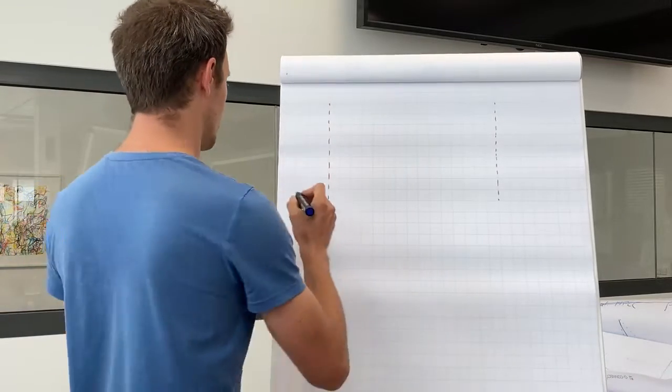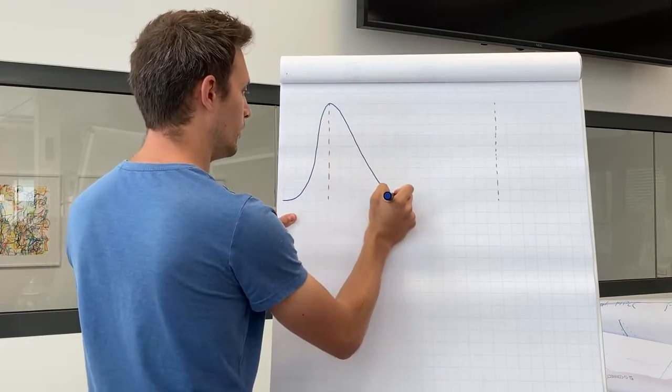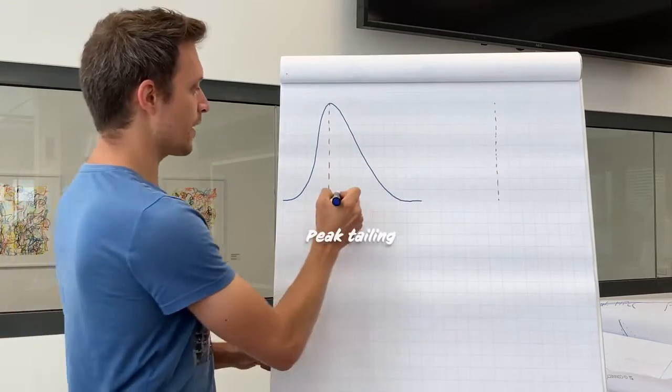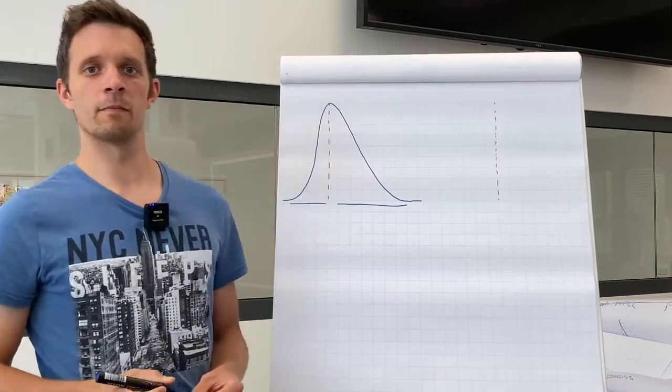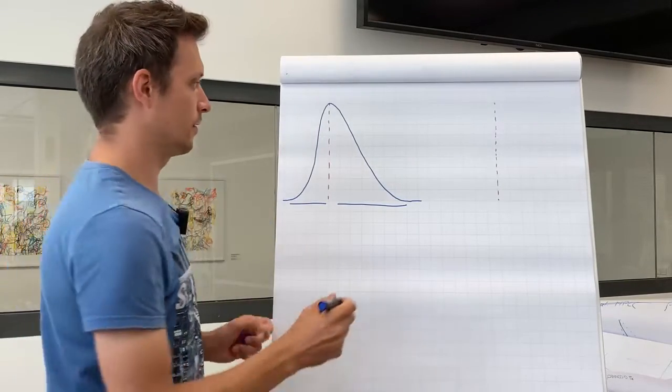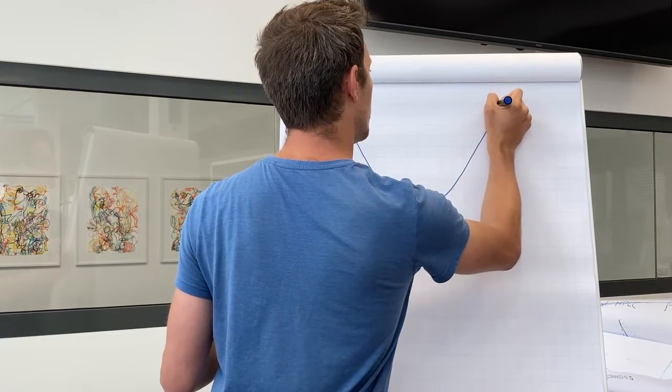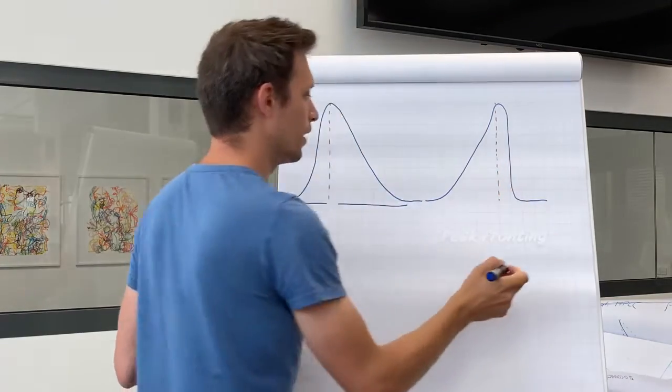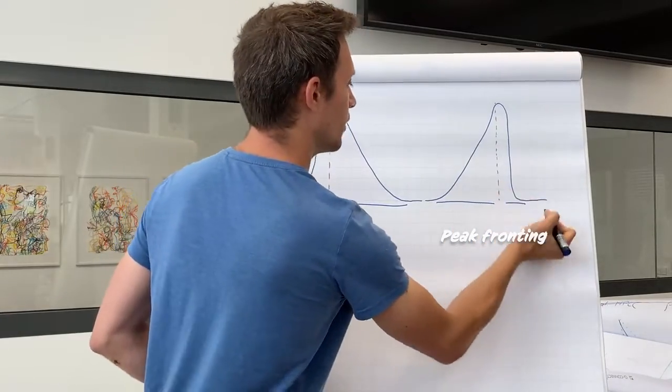First, let's define how these peak types look like. We'll start with peak tailing. Peak tailing occurs when the second half of your peak is much wider than the first half. The opposite of peak tailing is peak fronting. Look. Here, the first half of the peak is wider than the second half.